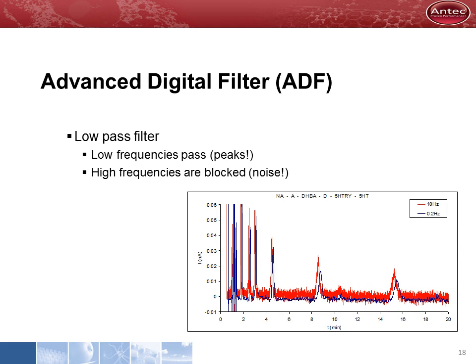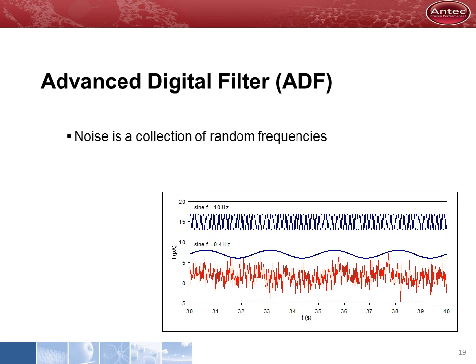We have developed an advanced digital filter which has been optimized for electrochemical detection. It is a low-pass filter which strongly suppresses high-frequency noise while peaks pass. A unique feature is that our filter has a very steep slope between the pass and stop frequencies. The noise on the baseline is nothing more than a collection of random frequencies, and using our advanced digital filter it is possible to suppress all these frequencies, making it much easier to recognize and analyze a chromatographic peak on the resulting flat baseline.